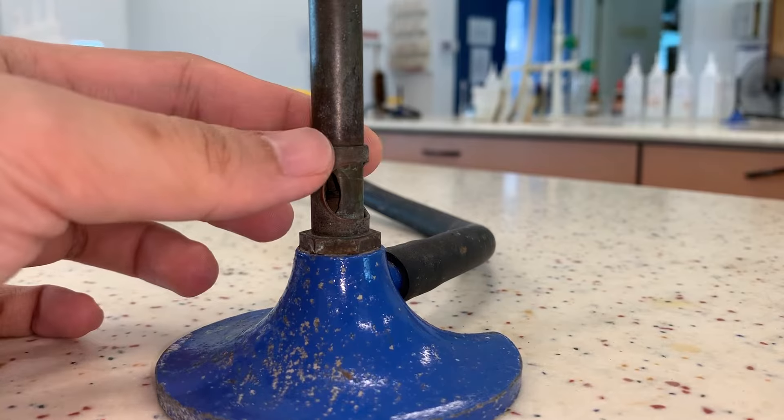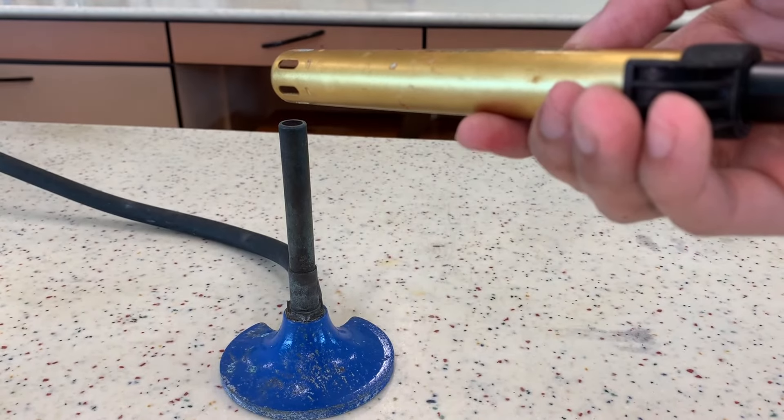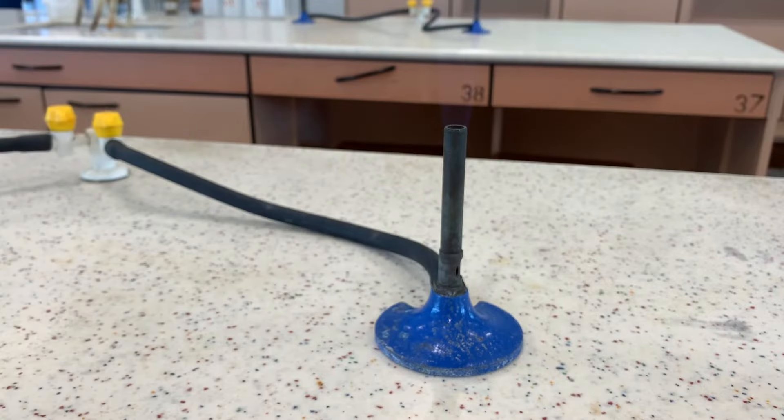Next we rotate the collar to close the air hole. Hold the gas lighter just above the barrel, turning on the gas tab at the same time. Ignite the lighter just above the barrel.